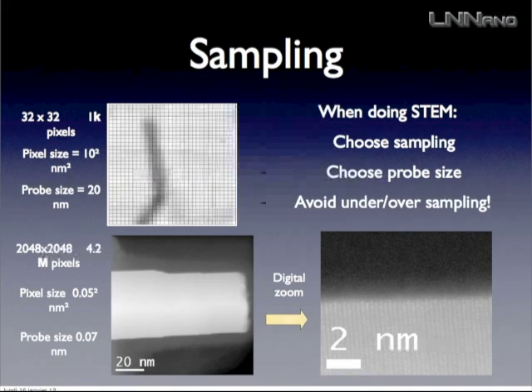So now I'm sure you know what a pixel is, and I will not comment a lot about that. But as the difference with a TEM, where you can change the resolution just by changing the magnification of the projector lens, here it's the opposite way around. You change the sampling of your beam. Okay, so that's as simple as that.